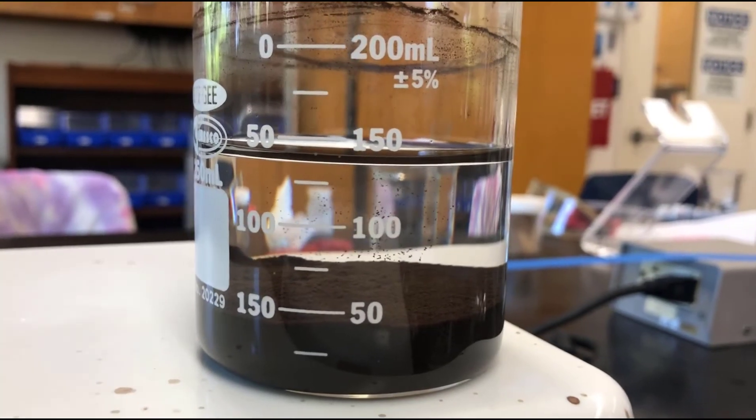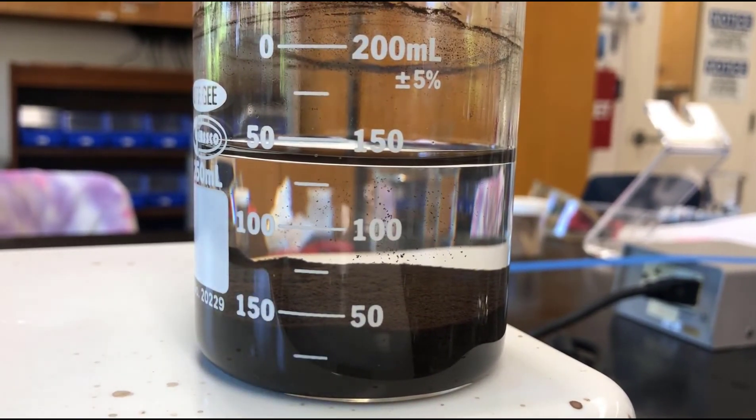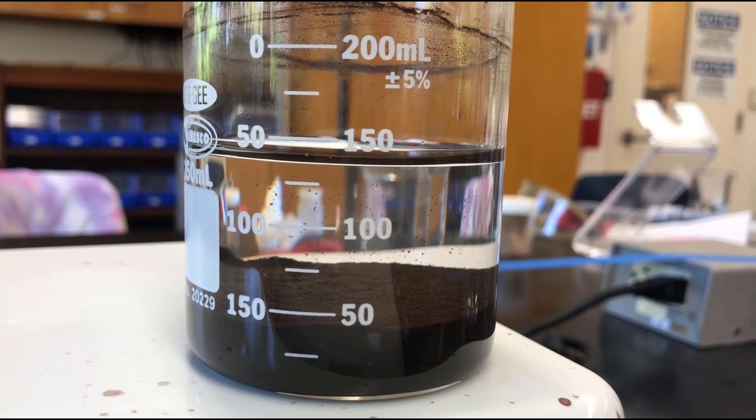I just picked this up and moved it, and you can see how much clearer it is, because we've allowed those crystals to grow from what we call cooking it. Now we can decant and try to get rid of the excess water, and then we can move on to the next step.